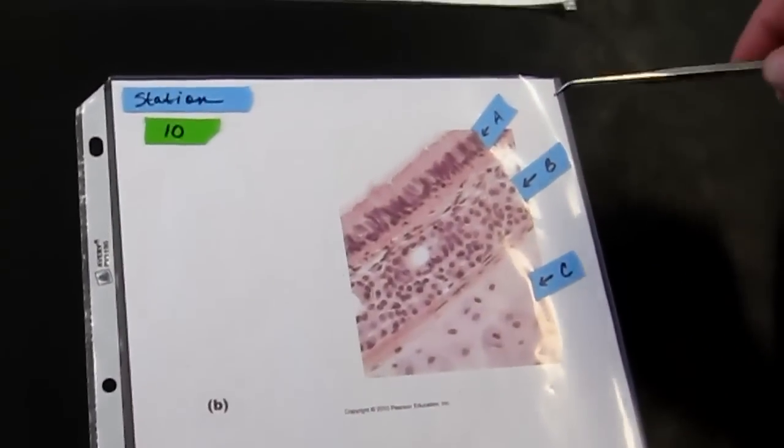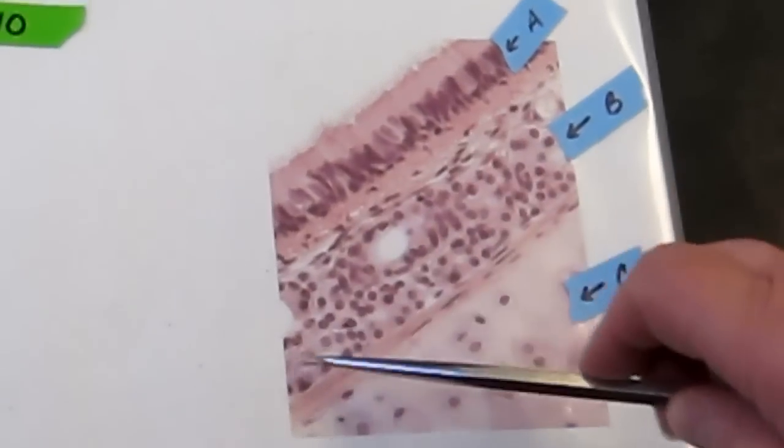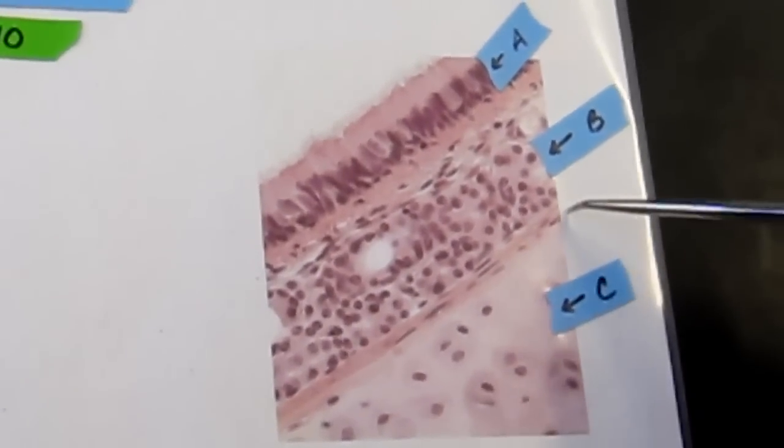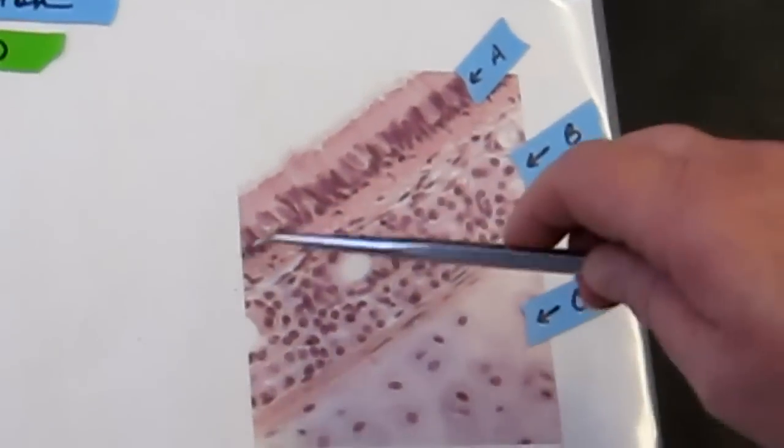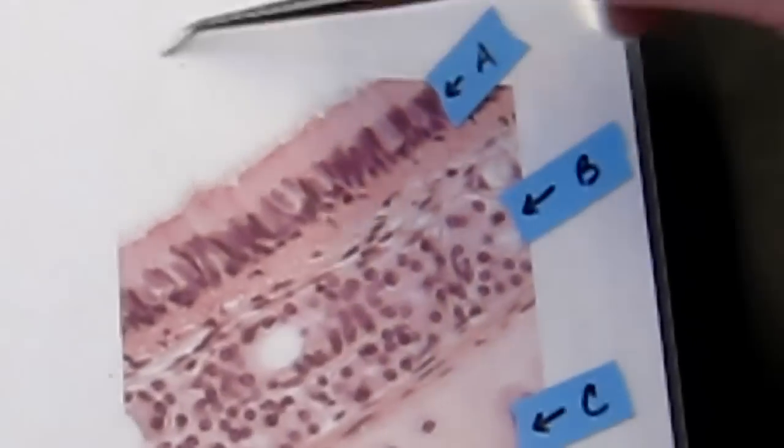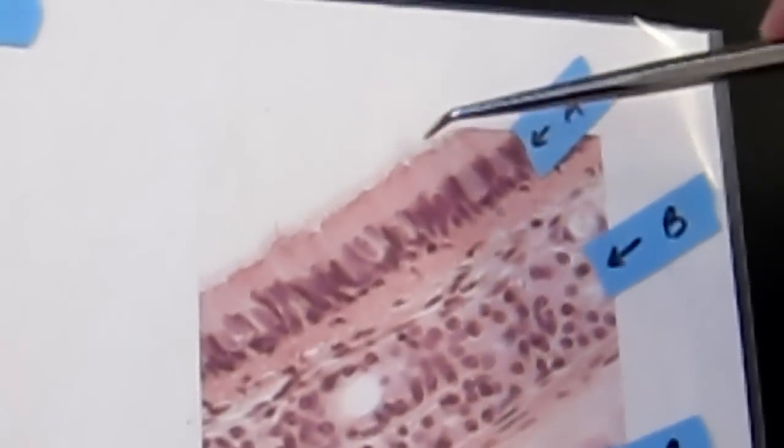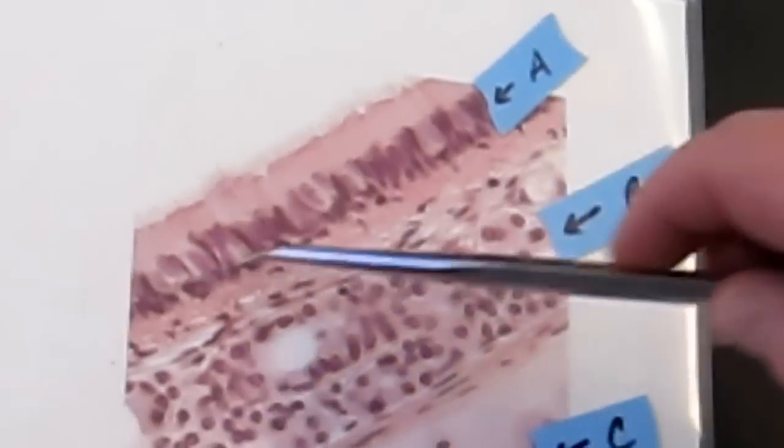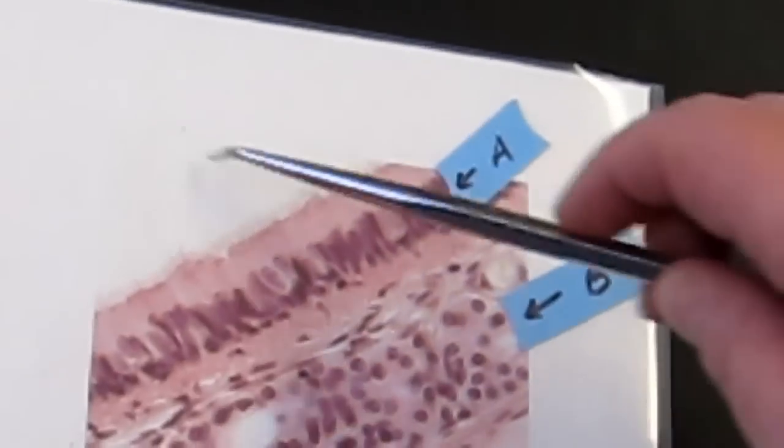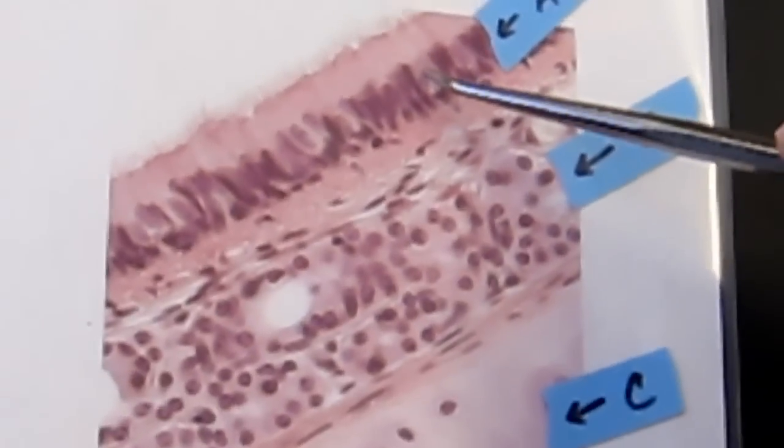Now let's switch down to this image, which is a higher power photomicrograph. Again, we have mucosa, submucosa, and adventitia, and we can see with a little more detail what the tissue of the mucosa looks like. The layer that's closest to the lumen, which would be here, is a pseudostratified columnar epithelium with cilia and goblet cells. So we can see that beautiful epithelium here. You can see the cilia facing the lumen. You can see the goblet cells here, and the goblet cells produce mucus.